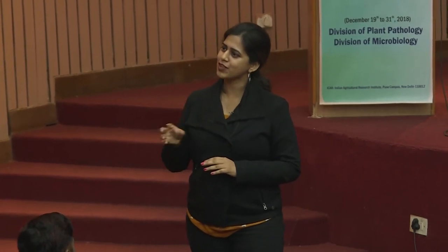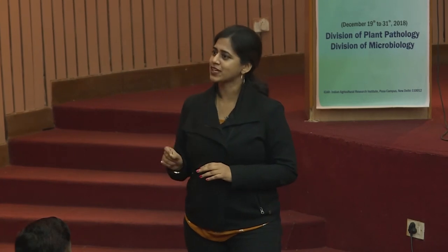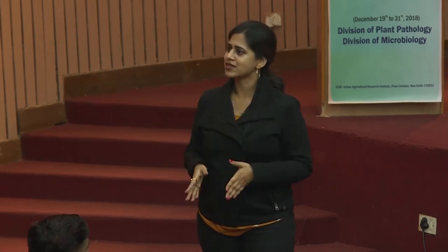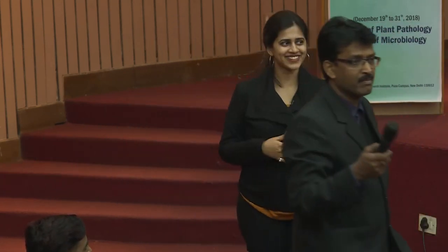The confidence level based on the read quality of that particular base, everything will be taken care of, and the mapping quality, at which confidence level it is mapping to the reference. For example, if in the read only 5 bases are mapping and the rest have mismatches, that read will not be considered in my SNP calling. I think with a lot of practice, your own confidence will also come.